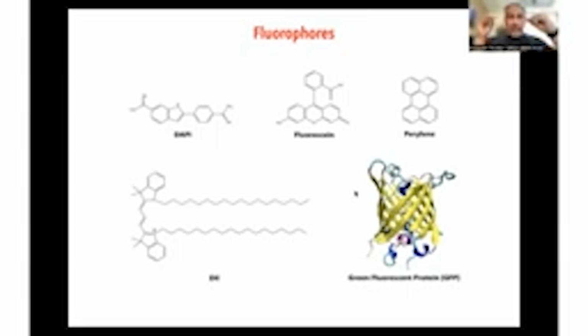So you can take a protein and add this tag to it, and this can be done by cloning: taking the DNA of the protein of interest, taking the DNA of the green fluorescent protein, and adding it side by side. You have now learned about translation, and you translate the entire protein, right? And so you have the protein with a fluorescent tag.